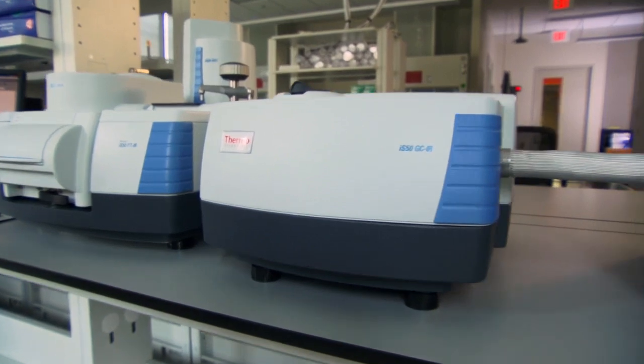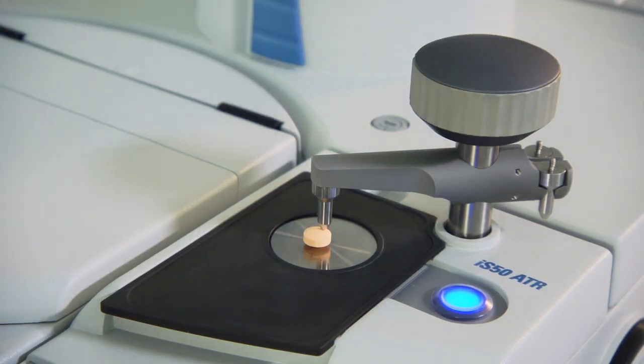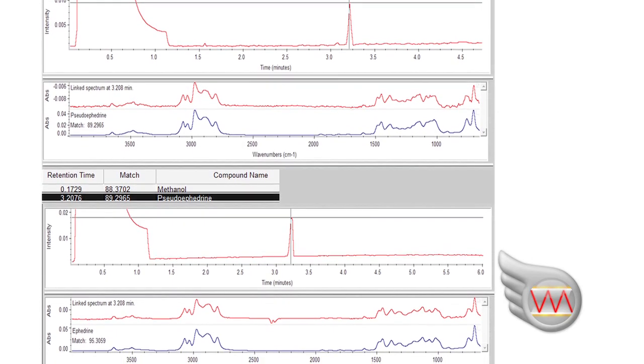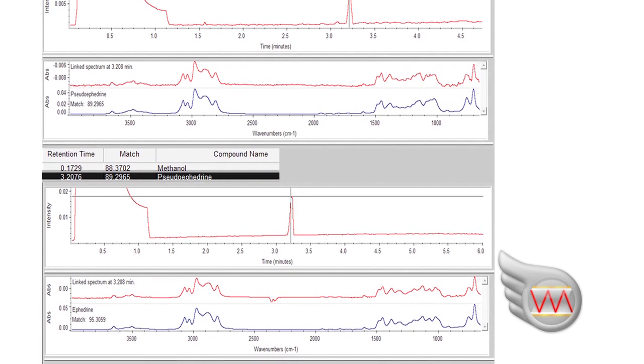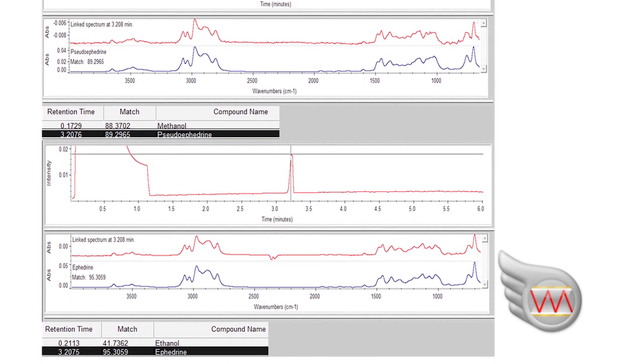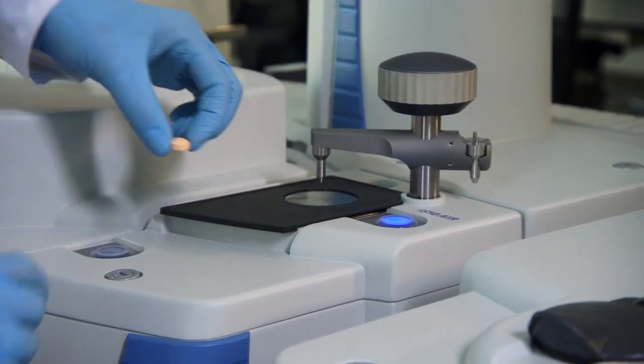It's just as easy to combine gas chromatography with FTIR to analyze differences between isomers like ephedrine and pseudoephedrine. Our new OMNIC mercury software simplifies drug analysis, reducing hours of manual peak identification into minutes. And no matter who's the operator, the results are the same.